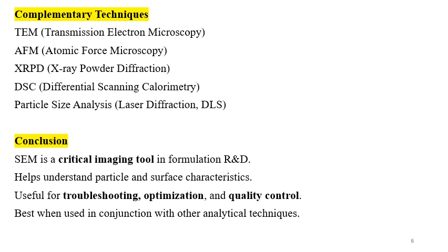SEM is a critical imaging tool in the formulation R&D, in the API R&D, in the process R&D, and it helps to understand the particle and surface characteristics. Useful for troubleshooting, optimization, and quality control. Best when used in conjunction with other analytical techniques. So you can use it with other techniques and then you can have some conclusion.